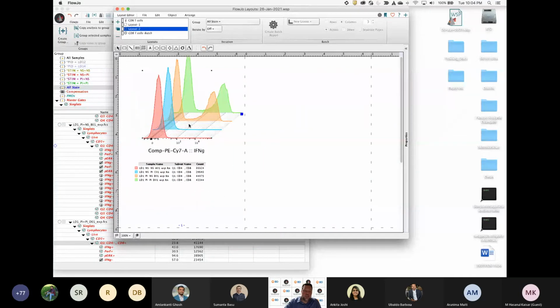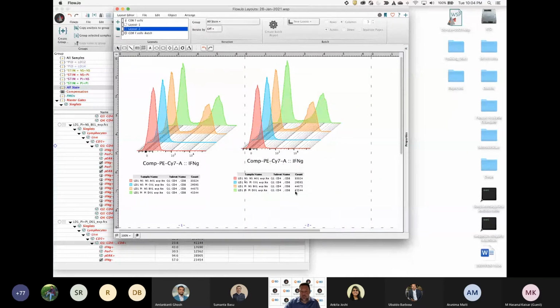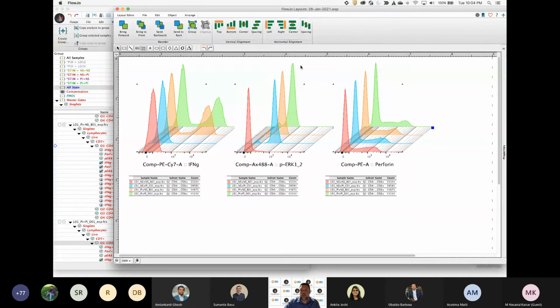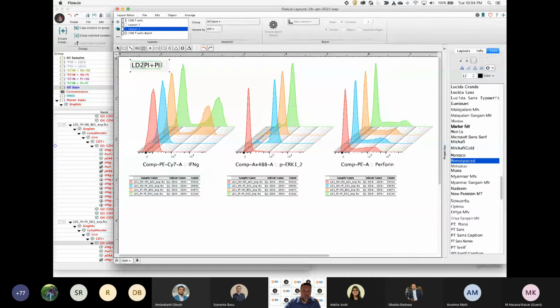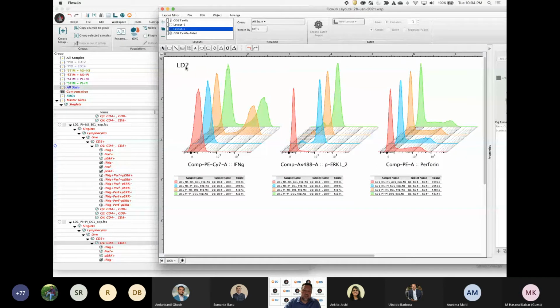You know, so I do a similar thing where I create one view and then duplicate this, change the parameter that I want to look at for the next one, right? So there's a different representation of the same data, and then a third parameter here. Maybe make my keyword labels, do arrangements here, and then you can iterate over this. And in this case, I don't need to iterate by sample because I actually am looking at one patient at a time here for all different conditions, right? So I'm just looking at patient by patient. With this type of overlay, I set this up actually using my LD1 nomenclature, but I'll turn on my panel or keyword iterator, and I just want to hammer this home before moving on.